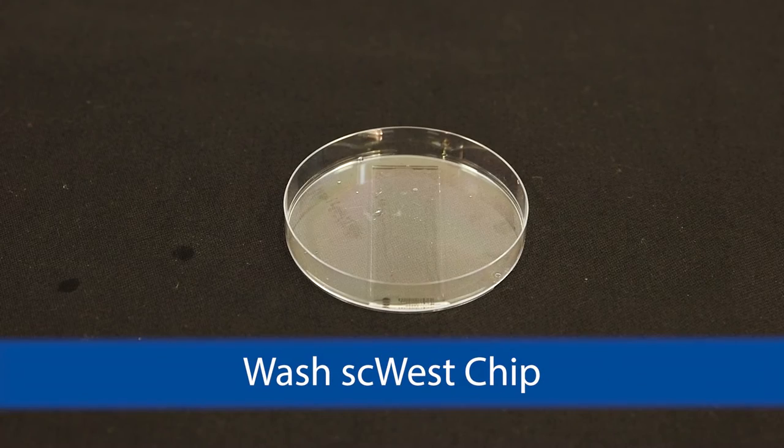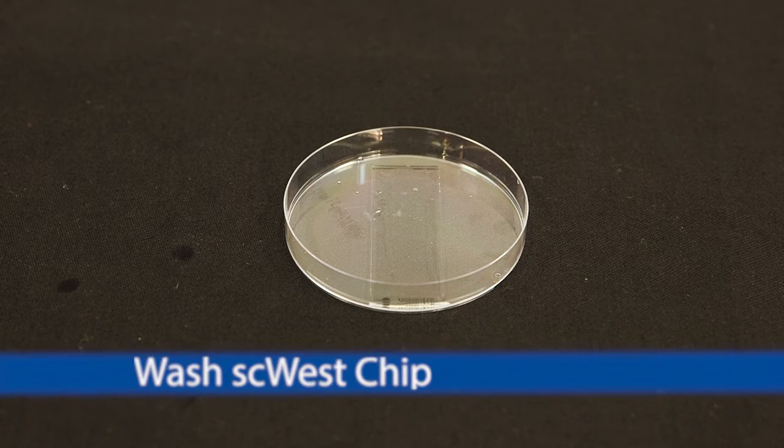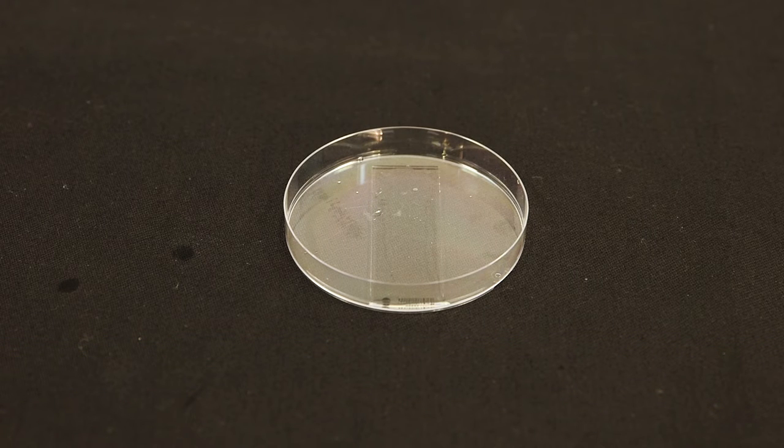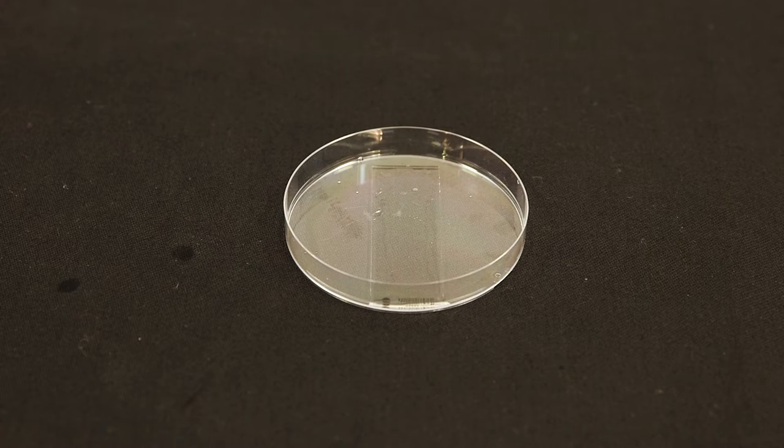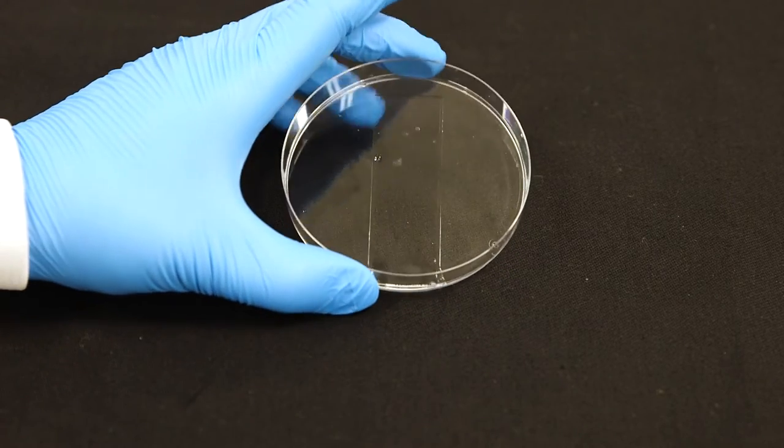After your cells have settled on the SC-West chip for 5 to 15 minutes, tilt the Petri dish at a 45 degree angle and aspirate off the cell suspension.